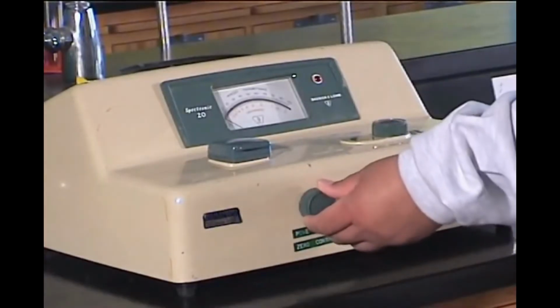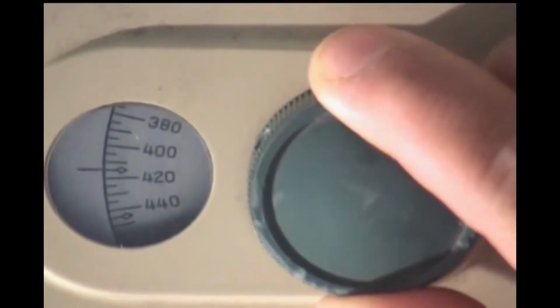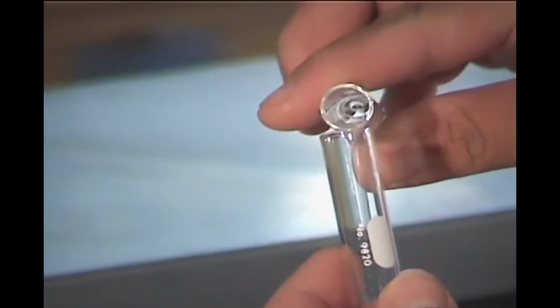To run an analysis, we turn on the instrument to allow it to warm up for at least 15 minutes. Next, we use the top knob to select the proper wavelength of maximum absorbance. One test tube that we'll call the cuvette is used for all measurement. This will minimize errors due to differences in the glass between different test tubes.